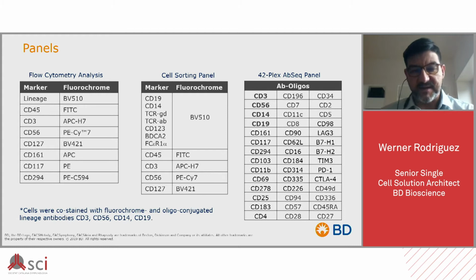These are, in a nutshell, our panels that have been used for this analysis. On the extreme left, you will see the flow cytometry panel that has been used as a reference for QC control before starting the whole process.